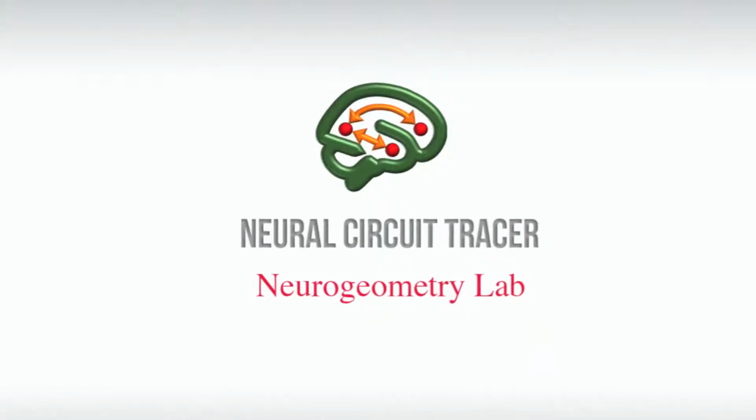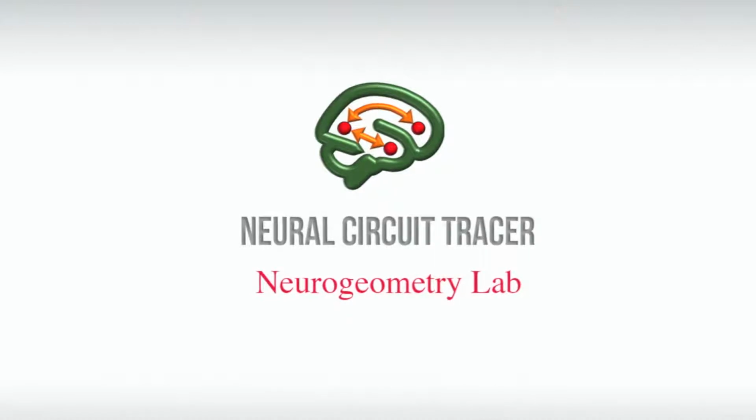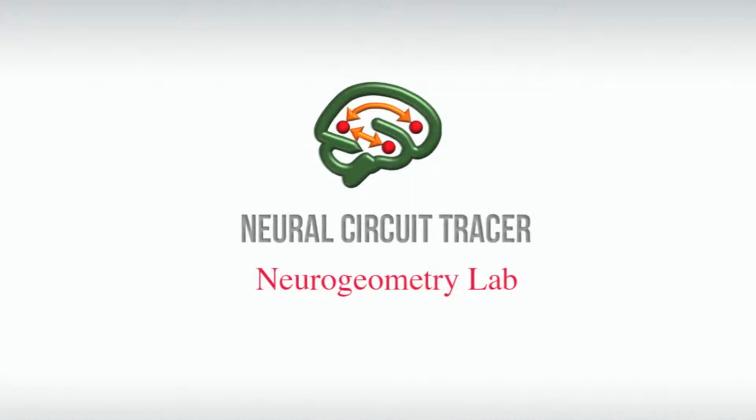NCTracer is software for automated and manual reconstruction of neurites from light microscopy stacks of images developed by the Neurogeometry Lab at Northeastern University. This video is an introduction to the basic functionality of the software's manual tracing and editing features.